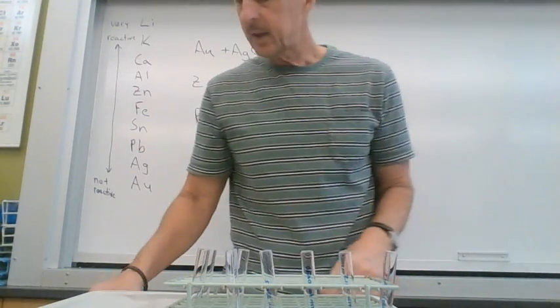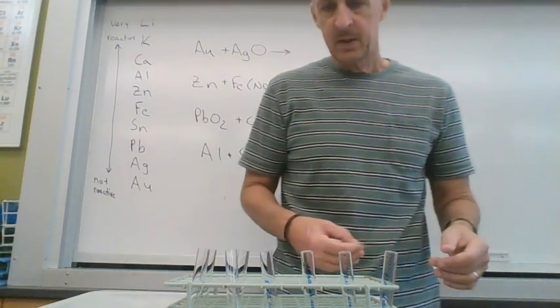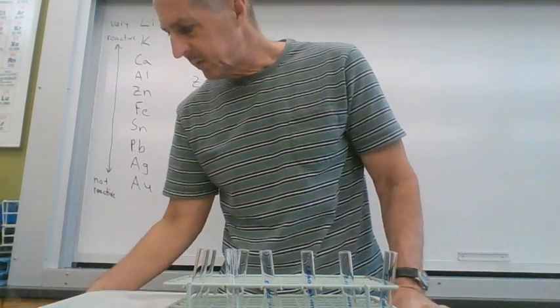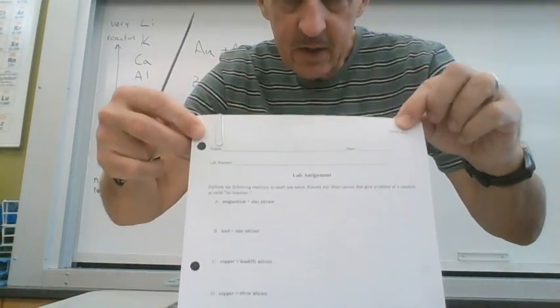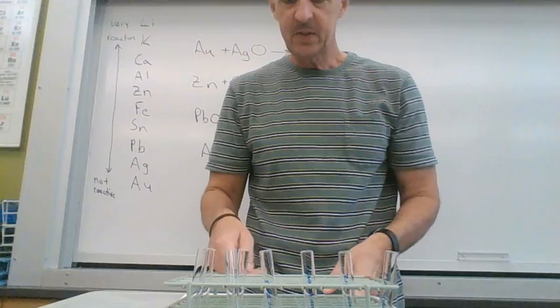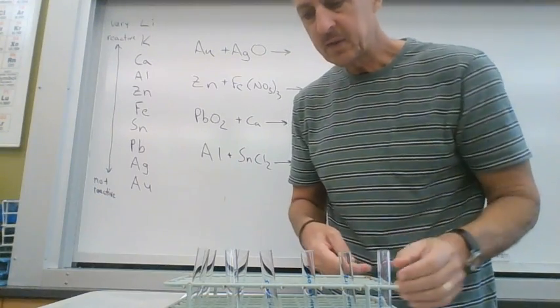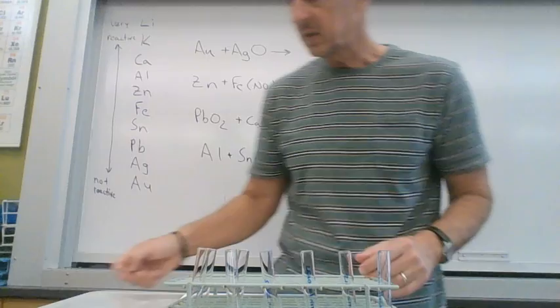All right, now we're going to collect the data for the redox and single displacement experiment. If you look at the first page of that experiment where you're supposed to start collecting the data, it should look like this. It tells you that you're mixing together different solutions. We're starting out with an aqueous solution of zinc nitrate, and we're going to add some magnesium to it, and look for any indications that a chemical reaction occurred.